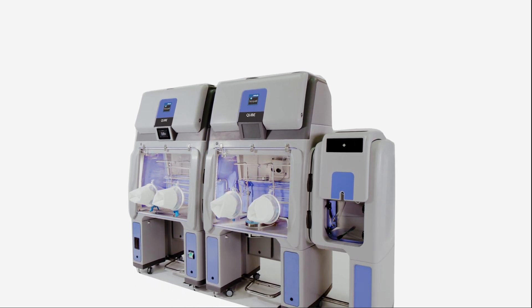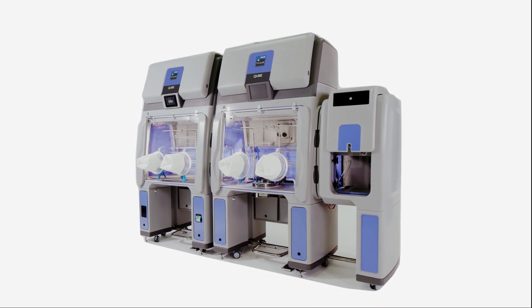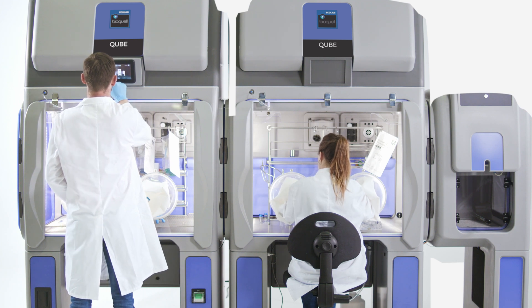Saving you from considerable operational downtime and potential construction costs. Capable of running at either positive or negative pressure, the BioQuell Cube can operate without being ducted into the HVAC as airflow is managed internally.